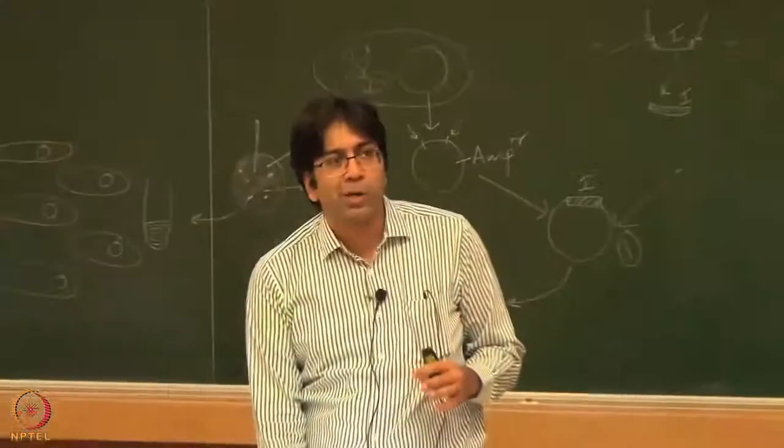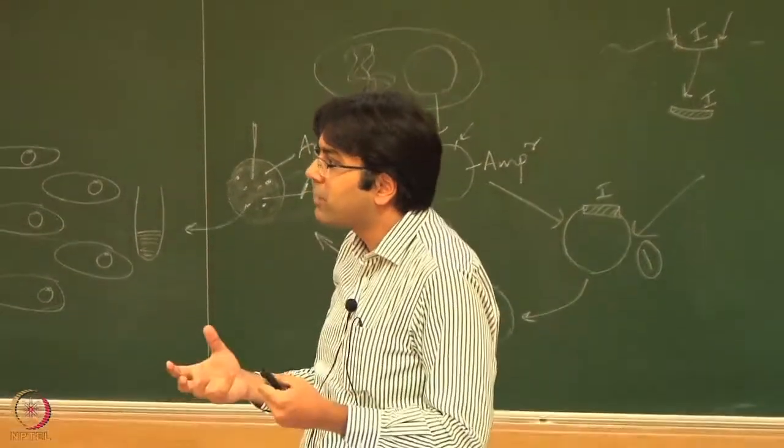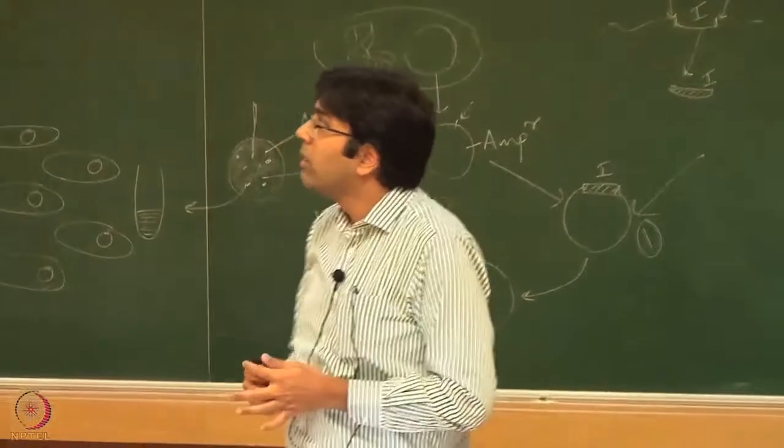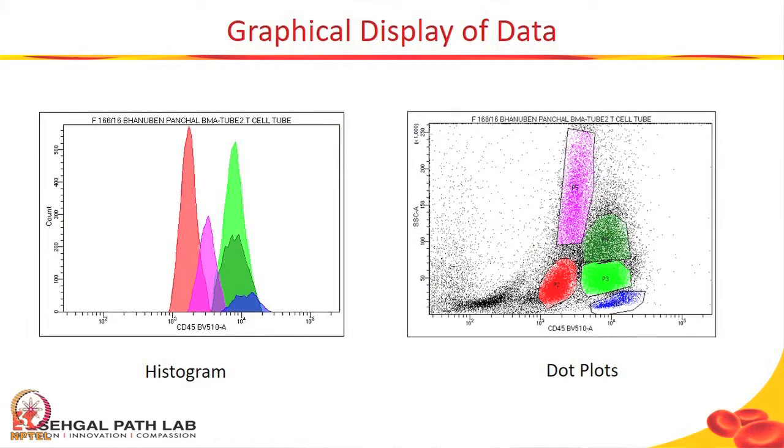So instead of going into flow cytometry, I thought for you guys, let's look at it from the data analysis perspective, because that might interest you more. Typically, when we're looking at flow cytometry data or any data, you can see a histogram, very simple. Single parameter, so we are evaluating the intensity of CD45 in the blue cells, which is more than that in pink and orange. Or you can look at a 2-parameter plot. You take one protein CD45 and you look at side scatter, which is nothing but granularity in the cell, and comparing 2 parameters, you can separate populations. When we had 1 color, 2 color, 3 color machines, life was simple.